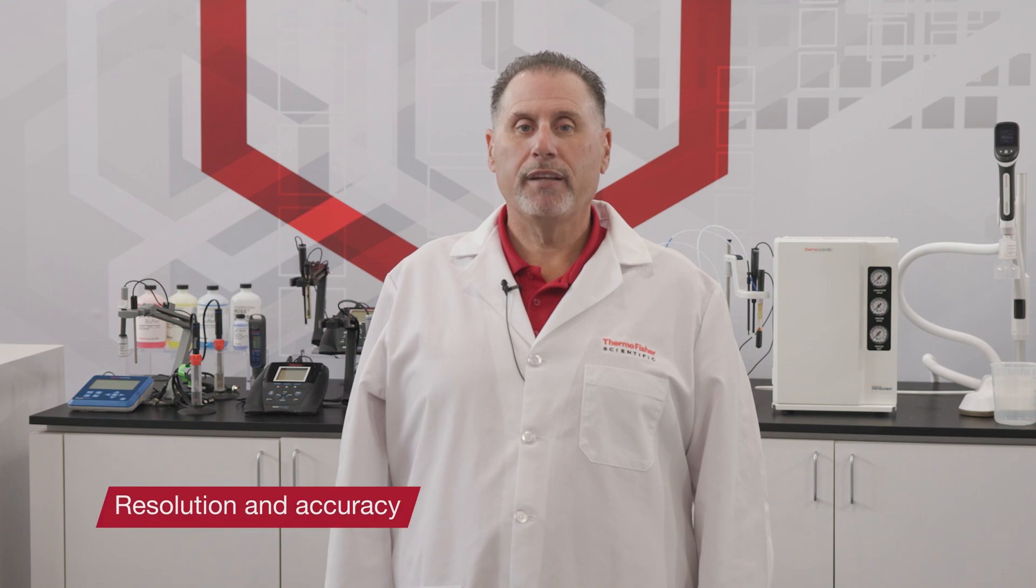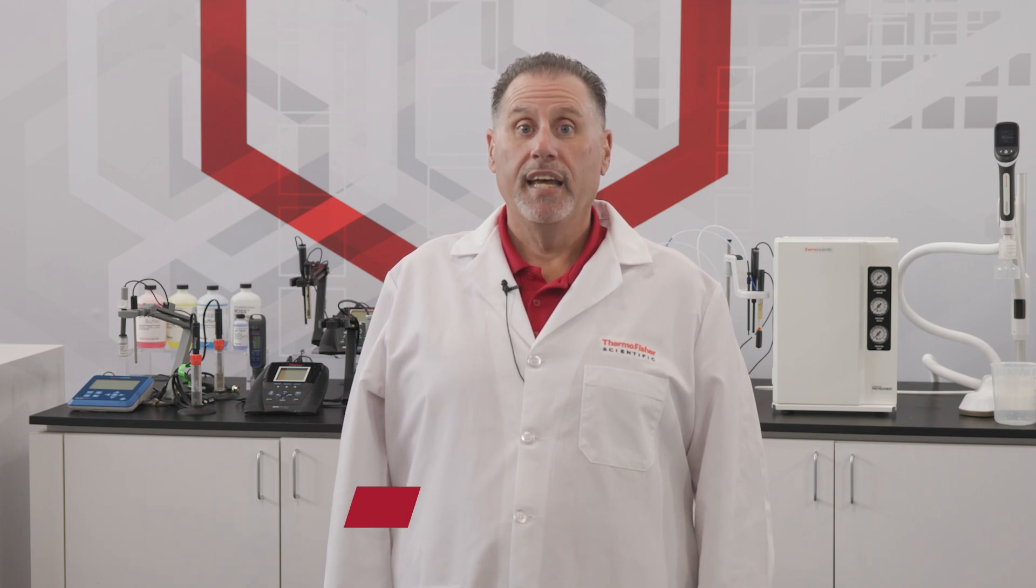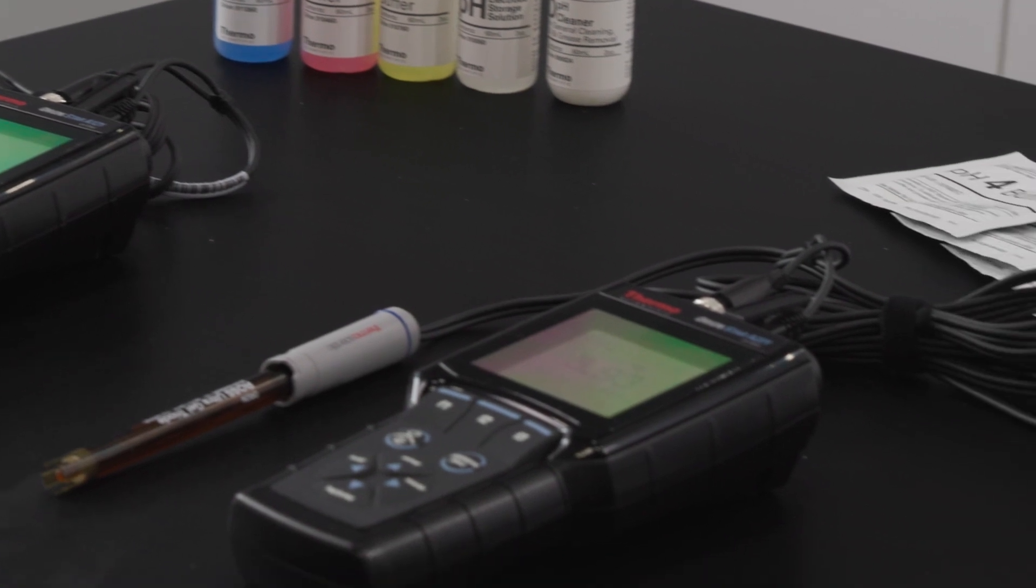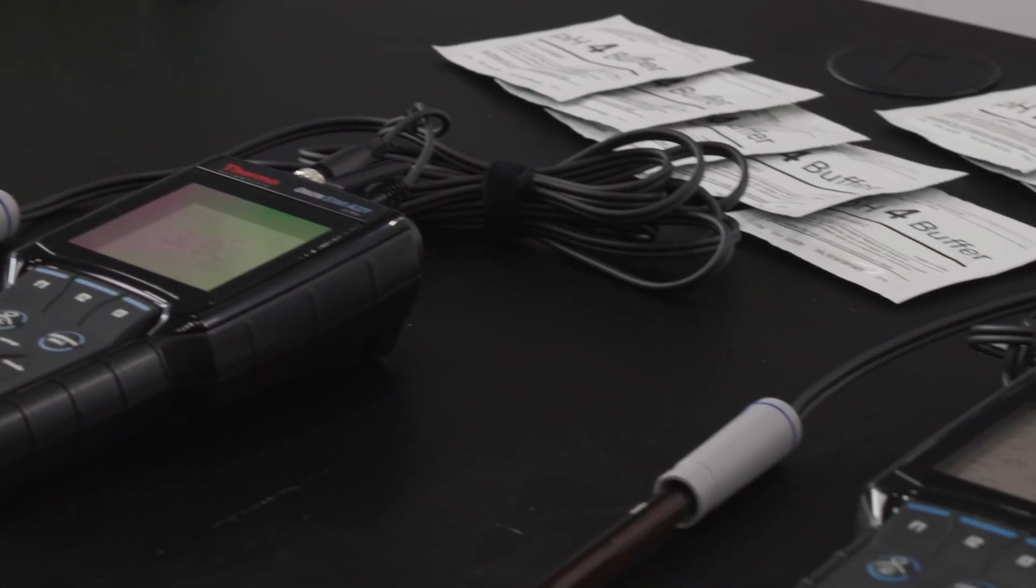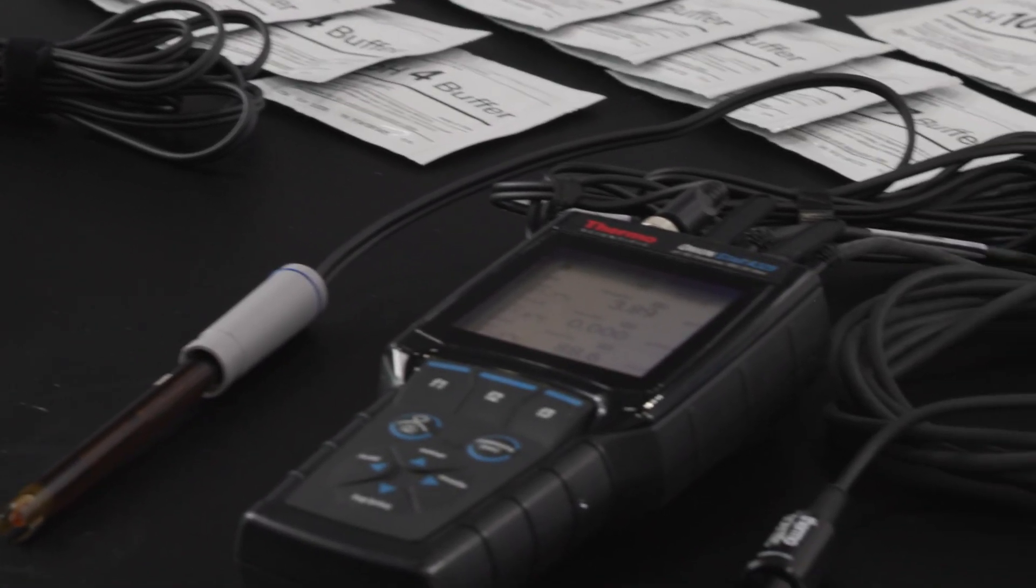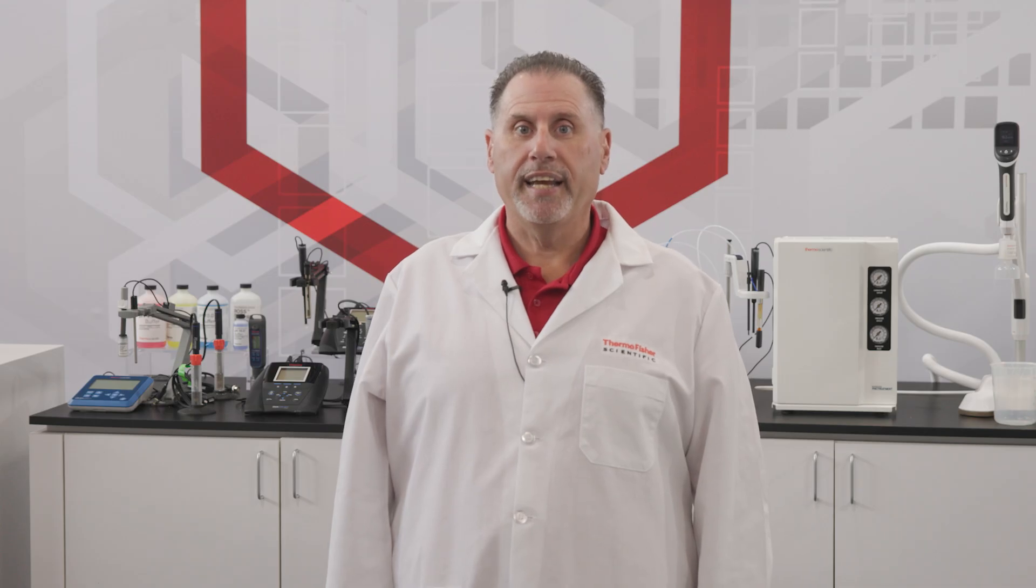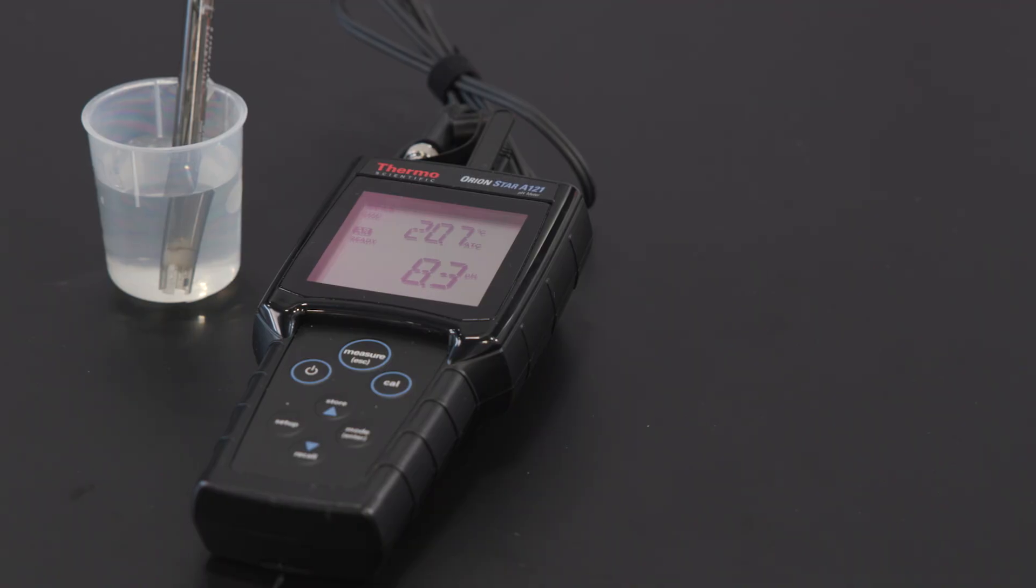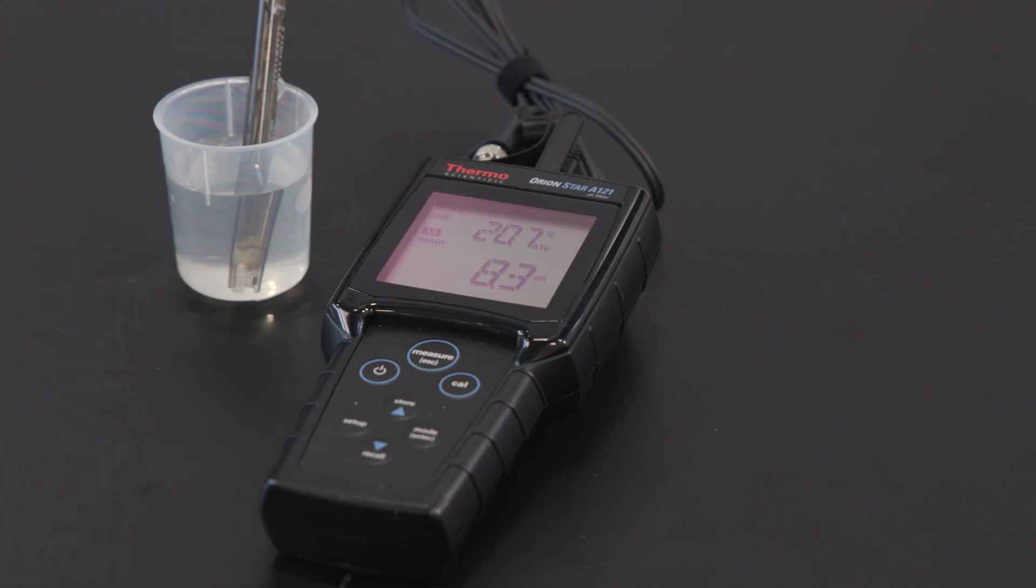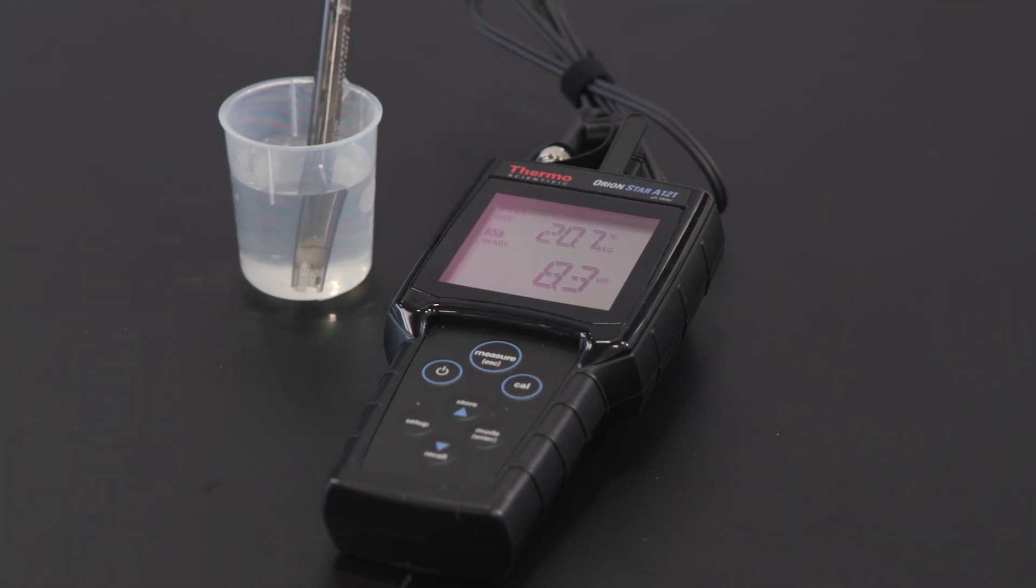Next, let's think about the resolution and accuracy required for your pH readings. Does your testing call for a resolution of 0.1, 0.01, or 0.001 pH? Verify your accuracy needs against meter specifications. Note that accuracy is dependent on the solution temperature during calibration and testing.